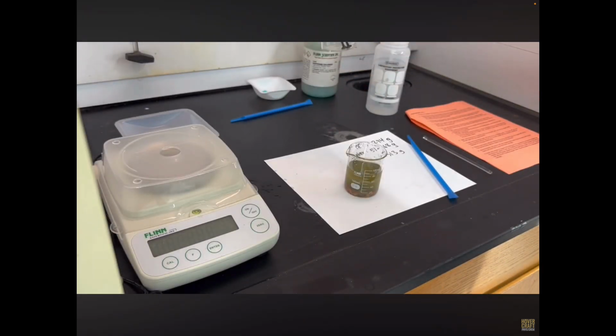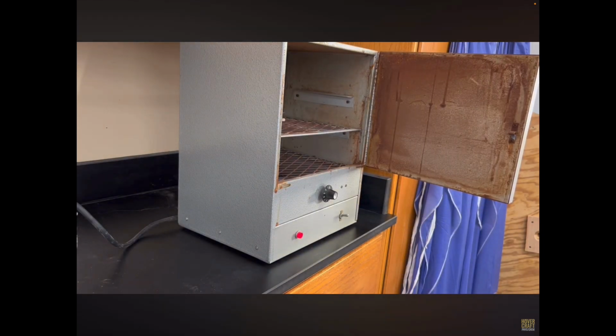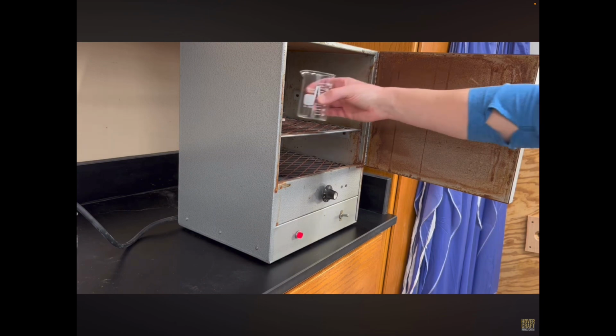So those are going to go to the drying oven, and I'll show you what that looks like in a minute. Doing the investigation, it'll be warm inside. There will probably be other beakers inside already drying, and you can just place your iron nails inside of that drying oven.